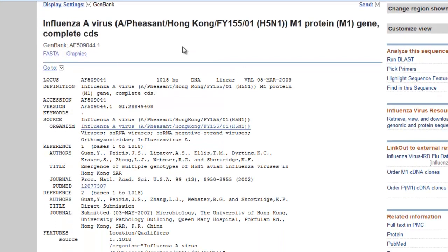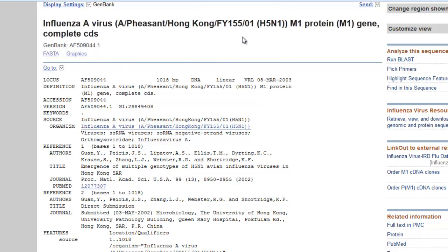We're going to be using this influenza A M gene sequence. Well, this is actually the M1 protein, or the M1 gene, which is part of the matrix gene of influenza. The M gene in influenza actually encodes for, I believe, three proteins.